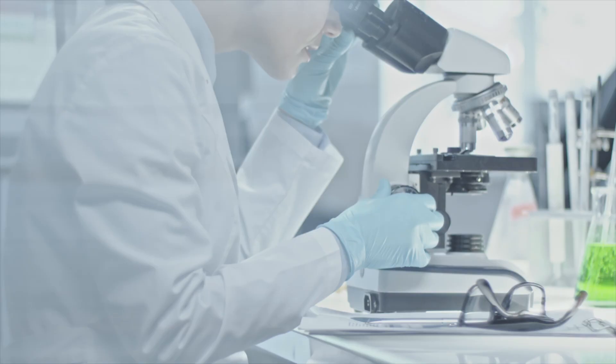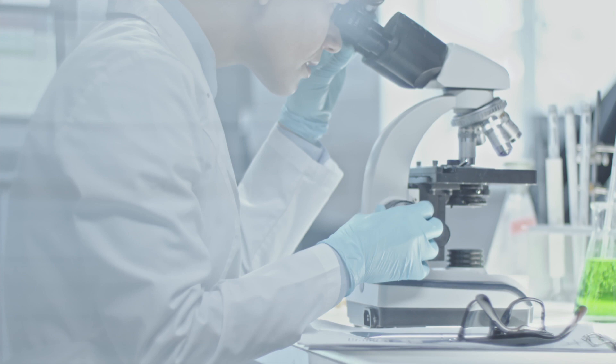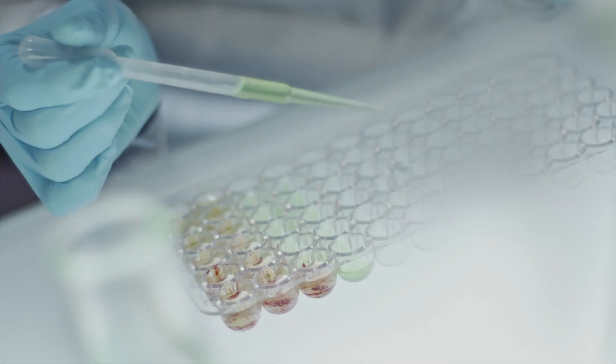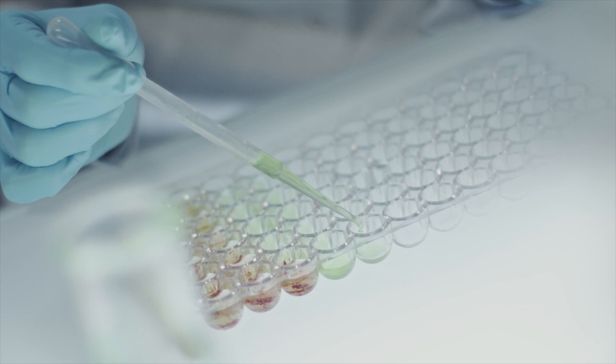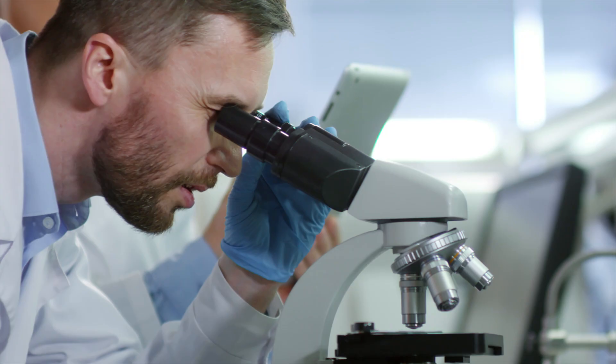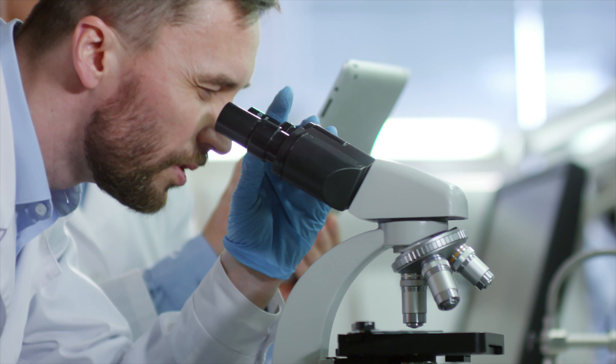The definition of micropropagation according to dictionary.com is the process of taking bits of tissue from a plant and using them to create more plants. With micropropagation we can use parts of a plant as small as a single cell, although I don't really know anything about that. Where I work, in our lab, we use much larger tissue samples. The footage I have is from our tissue culture process — there are other types of micropropagation but we can always talk about that later.